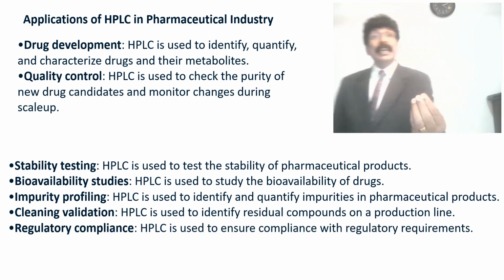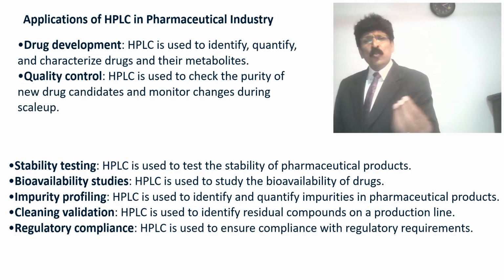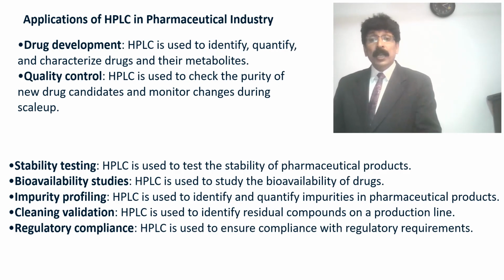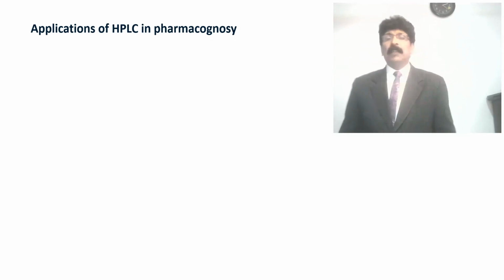Regulatory compliance, you can say: HPLC is used to ensure compliance with regulatory requirements. There are many. I have taken only those from an examination point of view.